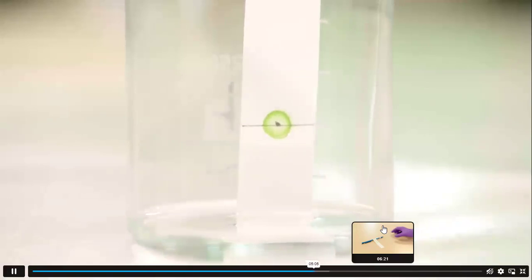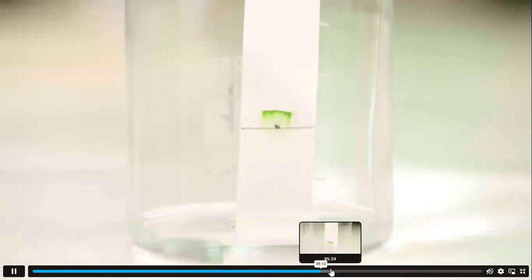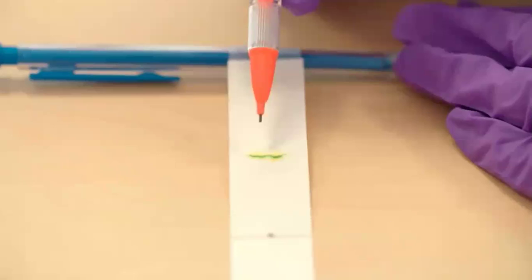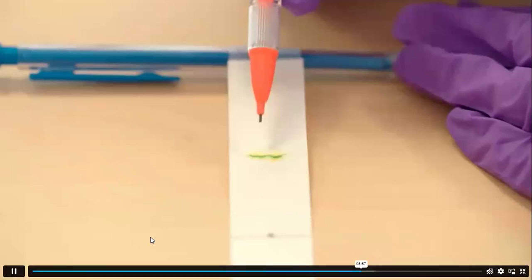You can see that the dye will be separated into its components. It's traveling up. You can see a little bit of green color and a little bit of yellow color in it. It's a combination of two colors. Then just take out the paper and draw the line in pencil which shows you the solvent front, and after that you can calculate the RF values.